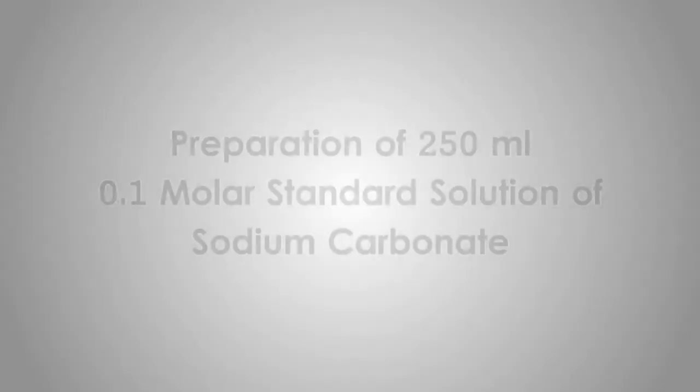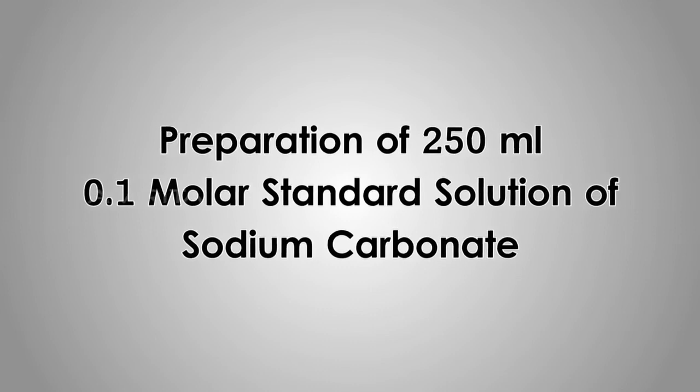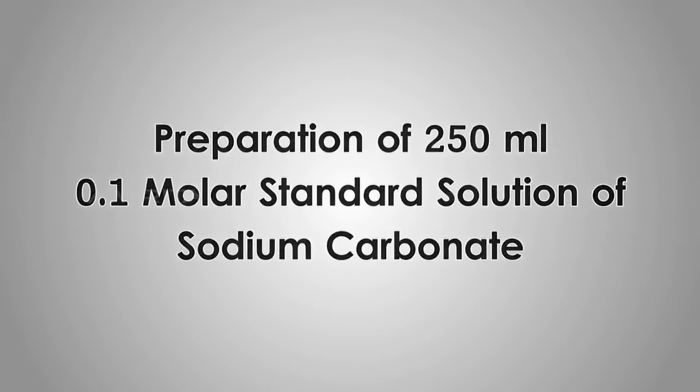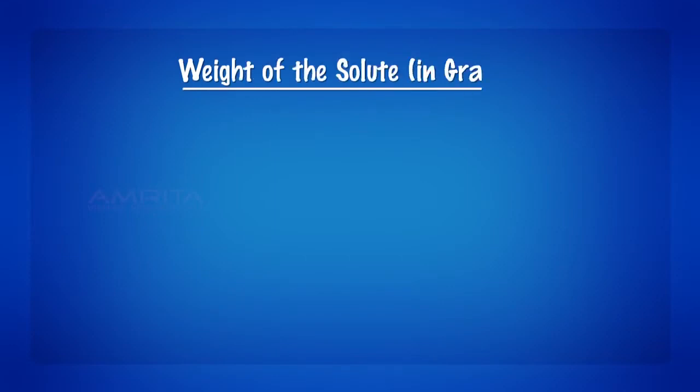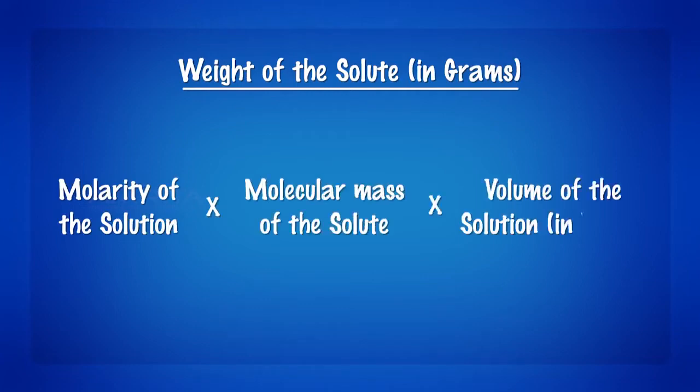Procedure: preparation of 250 ml 0.1 molar standard solution of sodium carbonate. The weight of the solute required to prepare a standard solution is equal to the molarity of the solution into molecular mass of the solute into volume of the solution in liters.